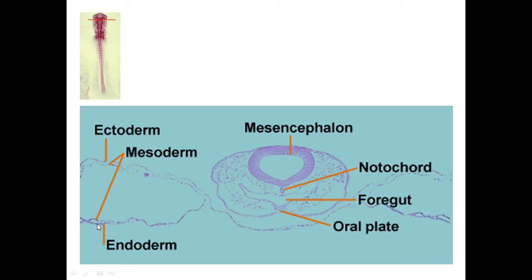This section nicely represents the division of the lateral mesoderm. So you have your splanchnic mesoderm and your somatic mesoderm, which, when they were delineated, we expect the coelomic cavity of the animal to be formed.